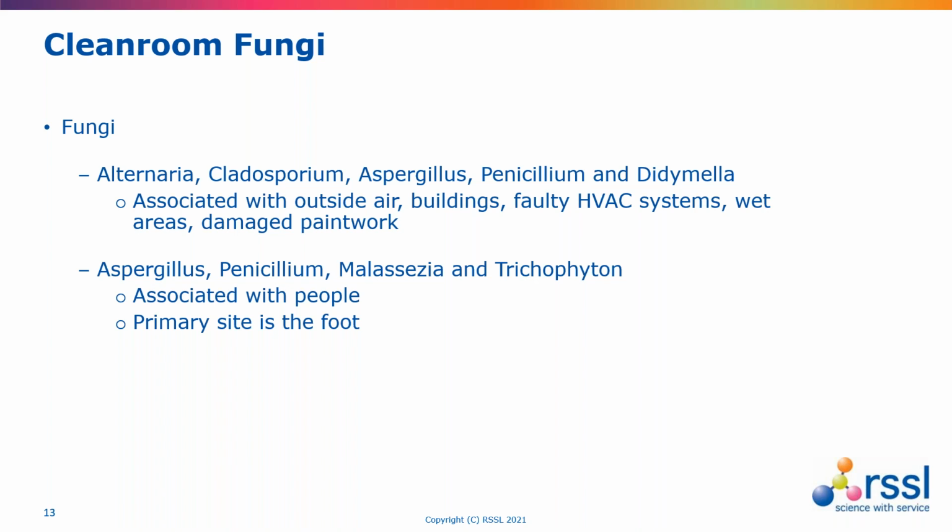scalp. It is also interesting from the human microbiome that the largest concentration of fungi is associated with feet, and particularly with the heel, which may again be another background reason why Annex 1 is introducing the clean room socks.